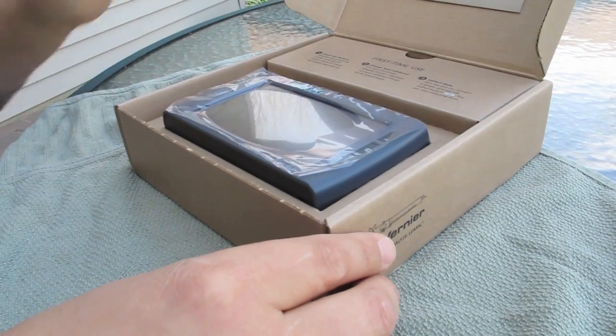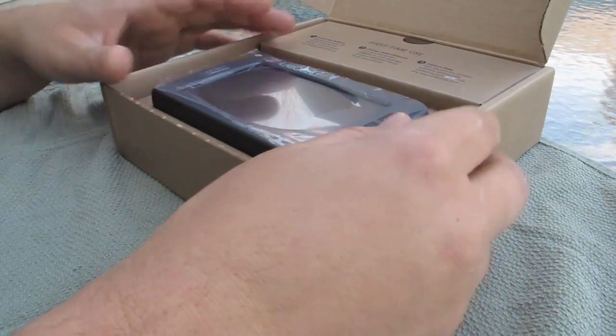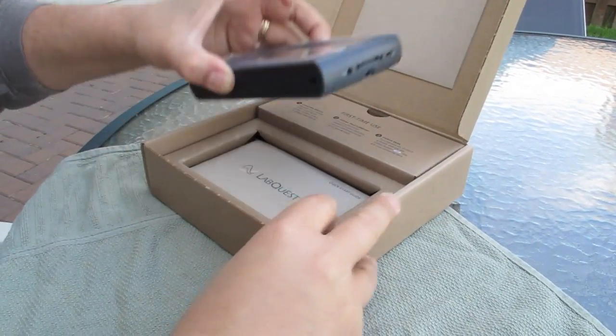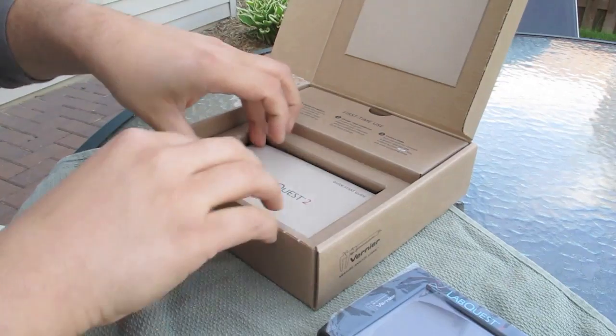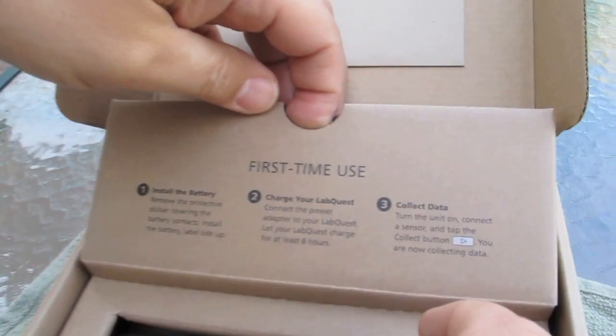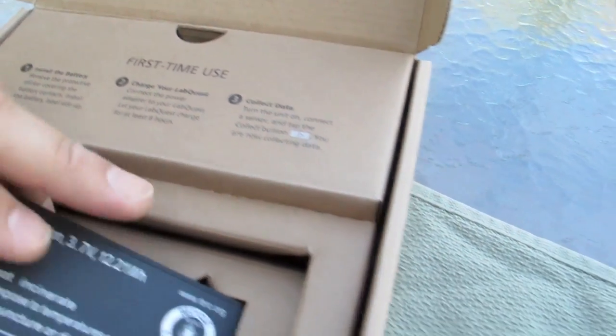Notice how there's not a little tab, a little piece of tape underneath here you have to rip open? You just open it. So what do we got? First of all, we got the LabQuest — set that aside. We got the Quick Start Guide, and up here they already have the first-time instructions: install the battery, charge your laptop, charge your LabQuest, and then turn it on. Start collecting.